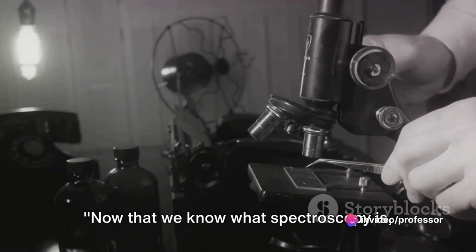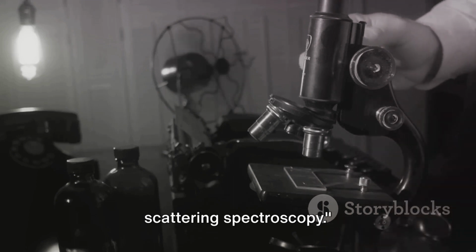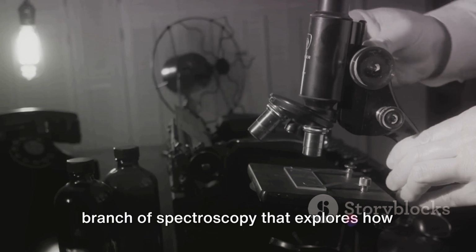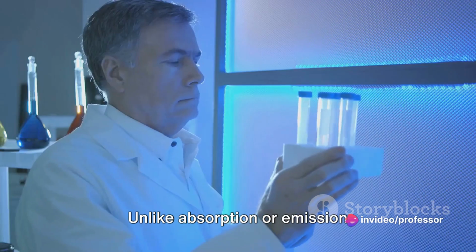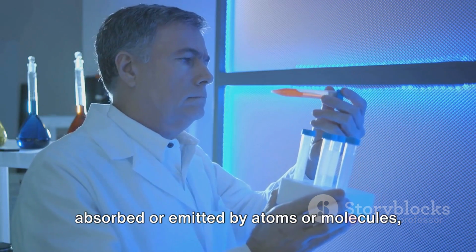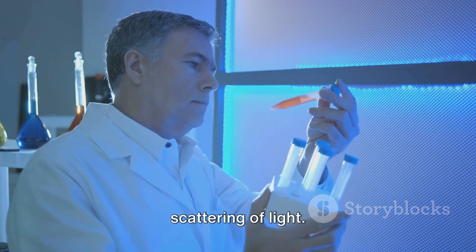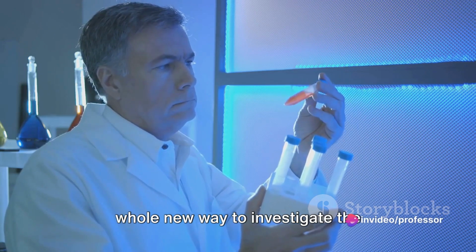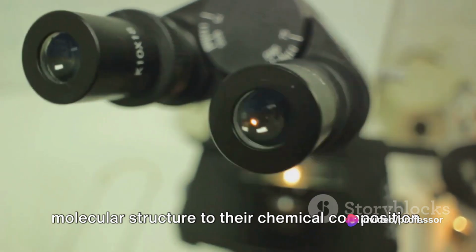Now that we know what spectroscopy is, let's delve deeper into one of its types: scattering spectroscopy. Scattering spectroscopy is a unique branch of spectroscopy that explores how light interacts with matter. Unlike absorption or emission spectroscopy, which deals with light absorbed or emitted by atoms or molecules, scattering spectroscopy is all about the scattering of light. It's a fascinating field that opens up a whole new way to investigate the properties of materials, from their molecular structure to their chemical composition.